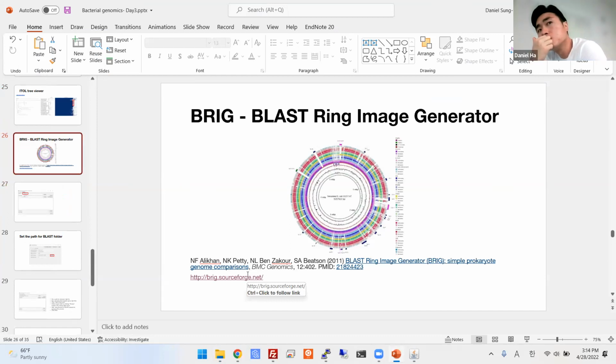Do I have to open it the same way we open it? Oh, with the Mac? Oh yeah, maybe. Yeah, you should Control and click. I did do that, but it's saying the Java jar file brig.jar could not be launched. So I have it here. And I have it right here.